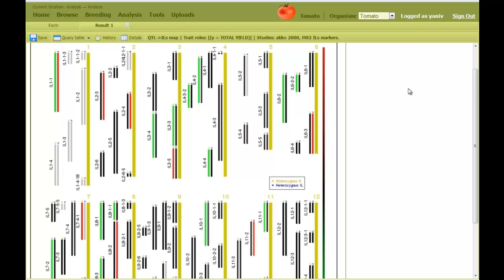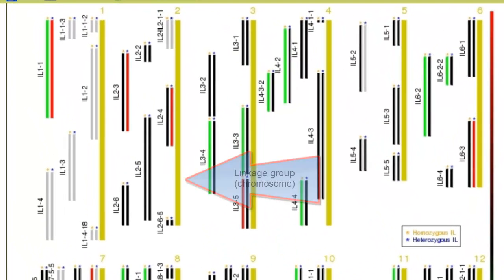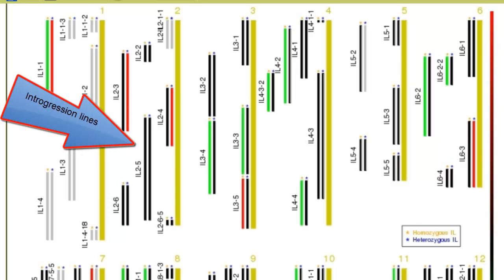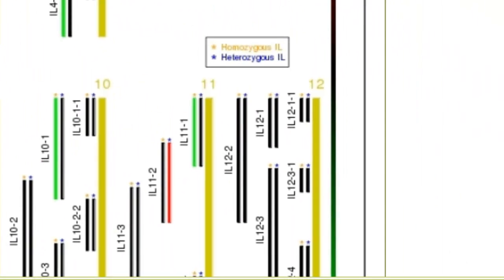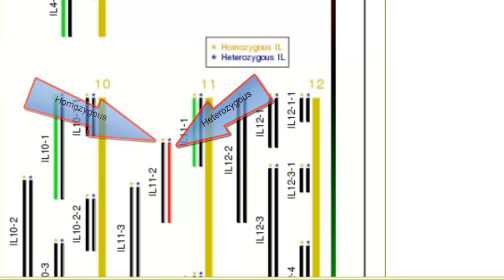The resulting figure shows an introgression lines map, where a vertical yellow line represents each of the 12 tomato linkage groups. The segments to its left indicate the location of the introgression lines that came from the donor parent. Each pair of parallel lines represents the homozygous and heterozygous states of the introgression. The left is homozygous, and the right is heterozygous, as can be seen in the legend.